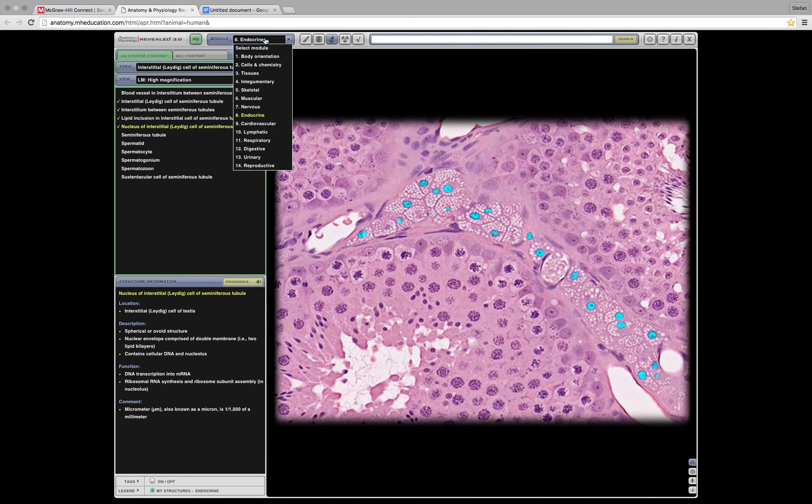Histology. Topic. Secondary corpus. Vagina, seminiferous tubule. Perfect. Perfect. Okay. So seminiferous tubules, that is the big circle. Low magnification. Yeah. I don't like that photo.